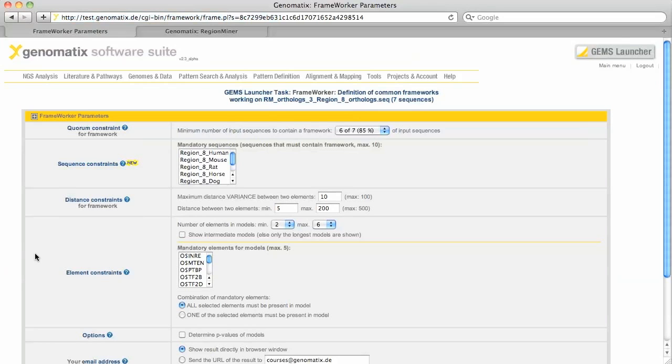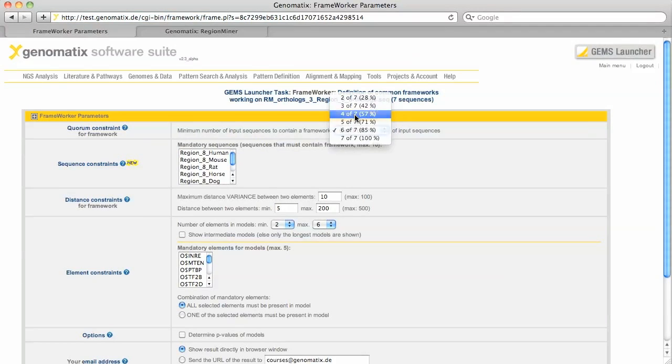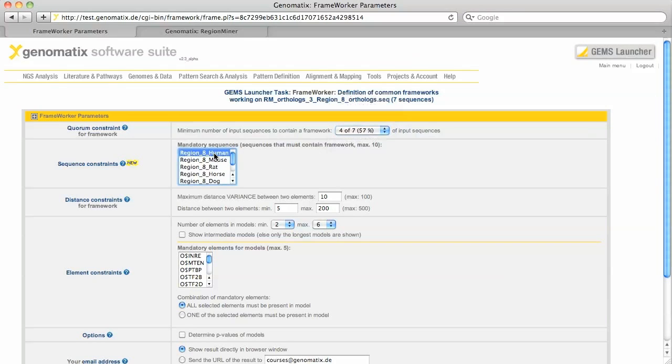I am going to set a few parameters here. We want to see the common patterns in at least four of our seven orthologues. The human orthologue has to be included in any case. And lastly the pattern must contain a STAT binding site.